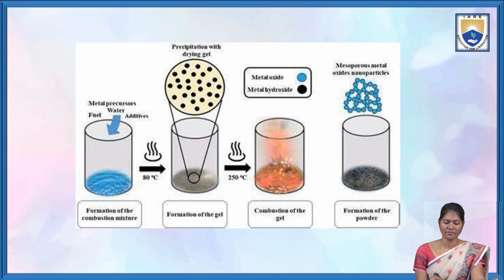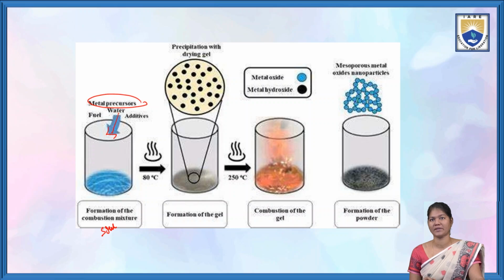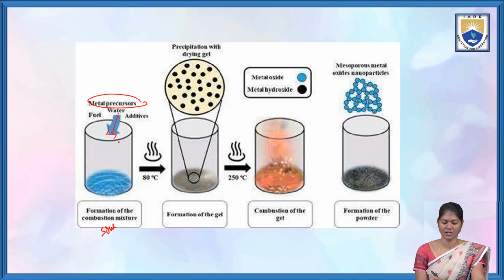So here there is a metal precursor which is added, a fuel, water, and additives. So here there is an aqueous solution with metal oxides, with metal precursors.